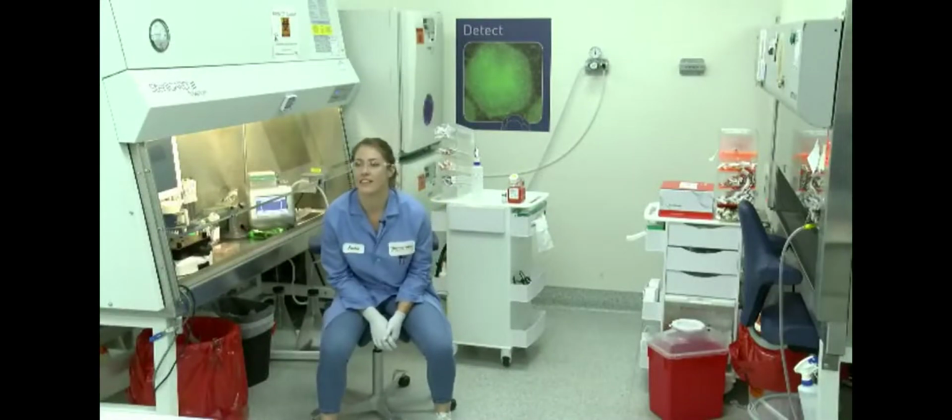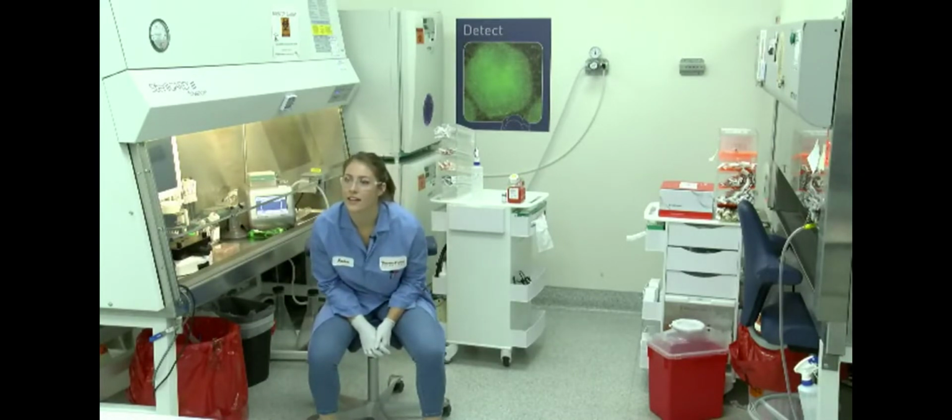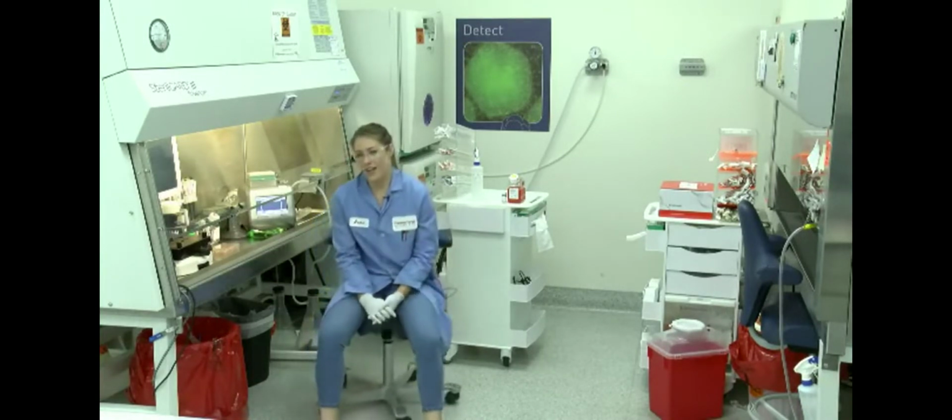Okay. And now we have another question that came in regarding transfection efficiency. Would you be able to speak a little bit about, let's take genome editing as an example, what kind of efficiencies you're getting with genome editing after using the Neon as a delivery machine? So the transfection efficiency you see totally depends on what you're delivering and your cell type and things like that. Typically you can see maybe between 20 and 40% transfection efficiency, but again, it totally depends, and that's just a ballpark estimate.